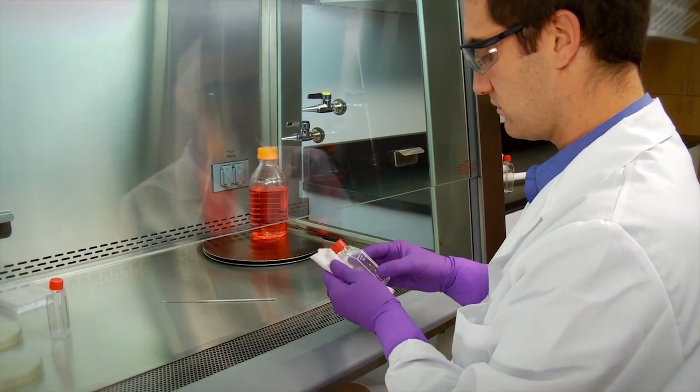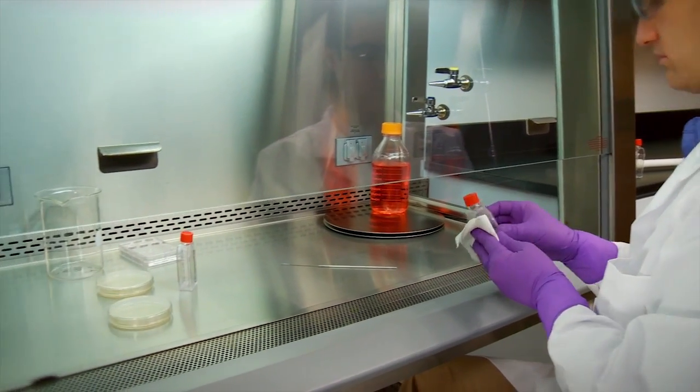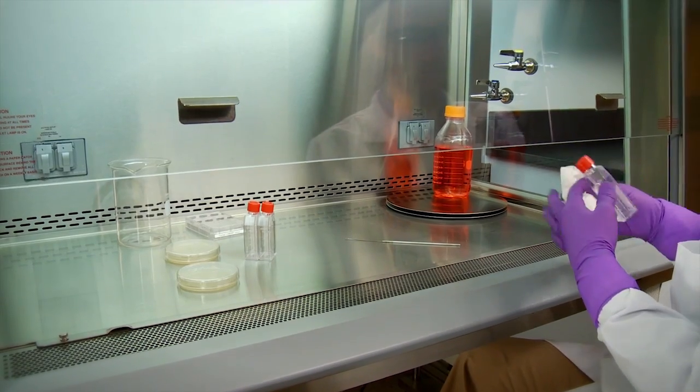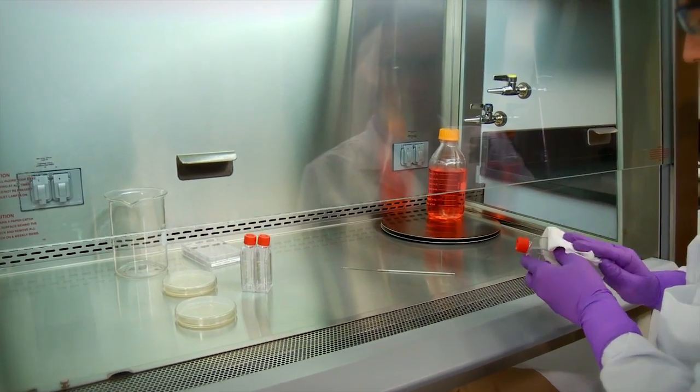You can further reduce the presence of microbes on materials used in your biological safety cabinets by periodically decontaminating incubators, refrigerators, and or nearby equipment.